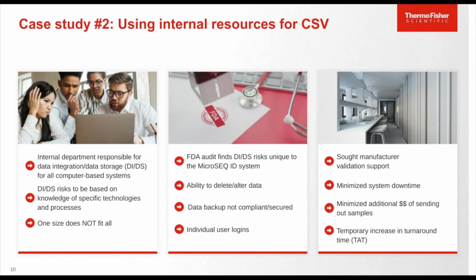The difficulty that we have here is that internal IT departments, being responsible for data integration and data storage, are responsible for all the computer systems across their entire company. So they're not specialists and they aren't aware of risks that need to be based on specific technologies and specific processes. They, again, don't know the MicroSEQ ID system. They can't be experts on everything. So in this case, one size doesn't fit all.